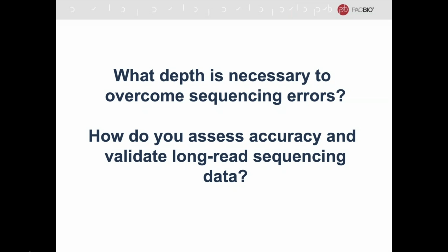It adds another layer of difficulty where you start separating out haplotypes, and addressing that heterozygosity and getting back to the target haploid assembly size has presented challenges, but we found ways. I think we're going to talk about that next, but we found pretty good ways to get around that as well.